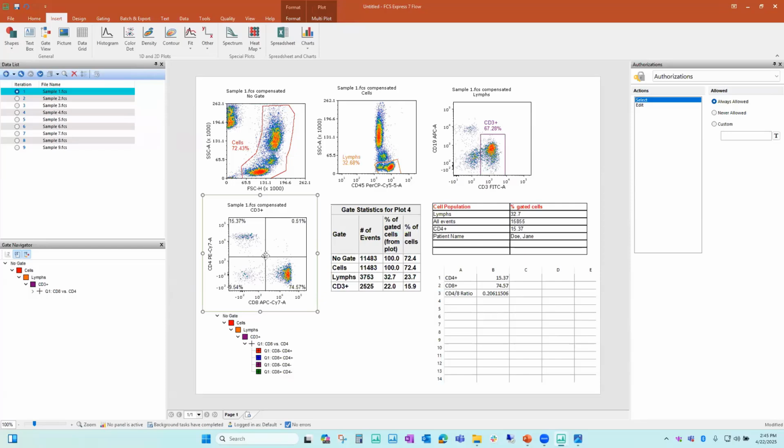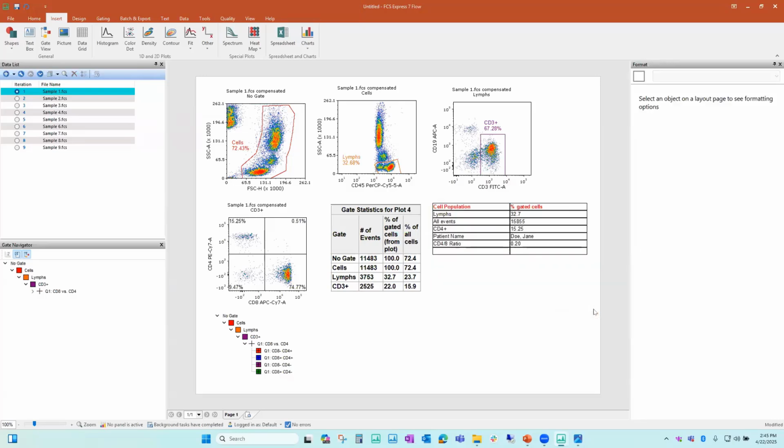As I said, everything updates in real time. So as I'm moving things around, that statistic updates. So I only have to calculate it once. And I can leave it in this spreadsheet if I want to, or I can use it as the calculation and then drag and drop something from this cell into my custom table. So if I click on this and I drop it here, I can hide this. I can just delete this.